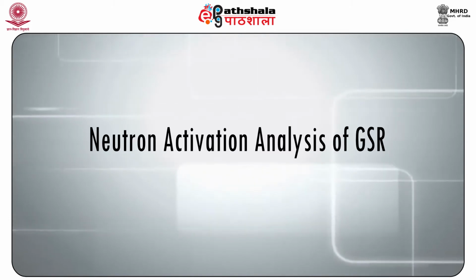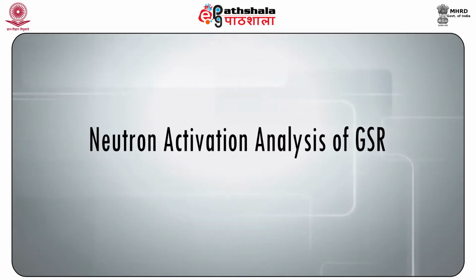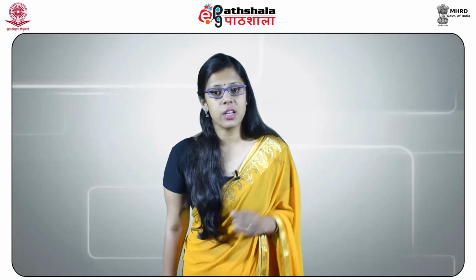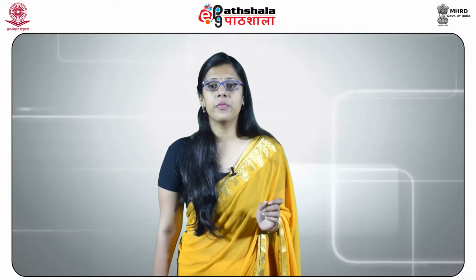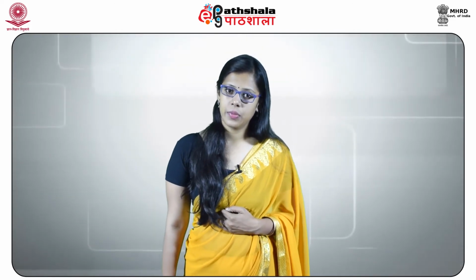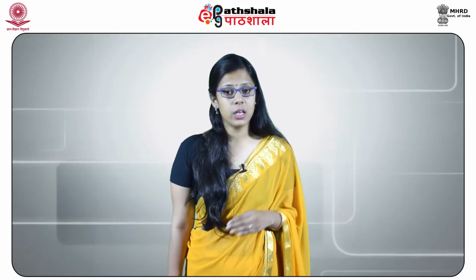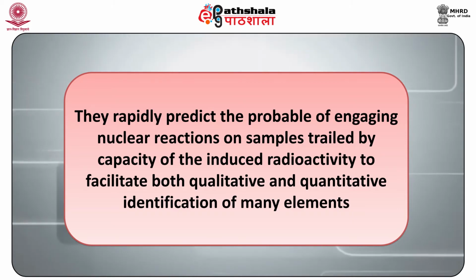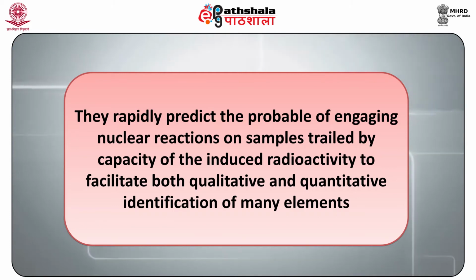Next we have neutron activation analysis of GSR, that is NAA. It is a general term for irradiating material with neutrons to create radionuclides. Neutron activation analysis was discovered in 1936 when Hevesy and Levi revealed that samples containing certain rare earth elements become extremely radioactive after exposure to a source of neutrons. From this scrutiny, they rapidly predicted the probability of nuclear reactions on the sample, followed by the capacity of the induced radioactivity to facilitate both qualitative and quantitative identification of many elements.